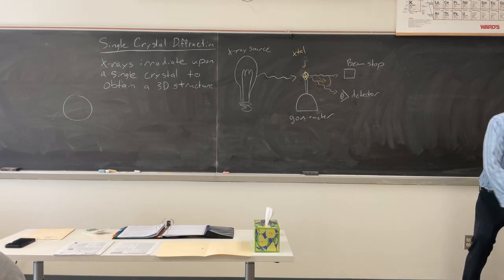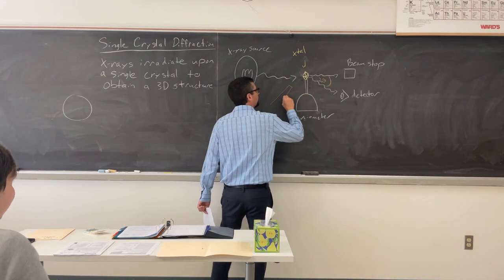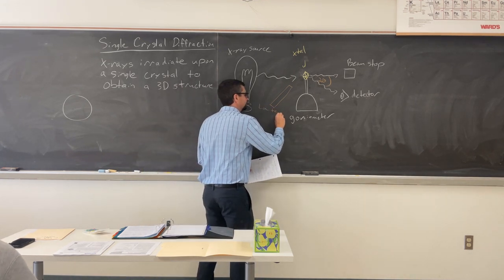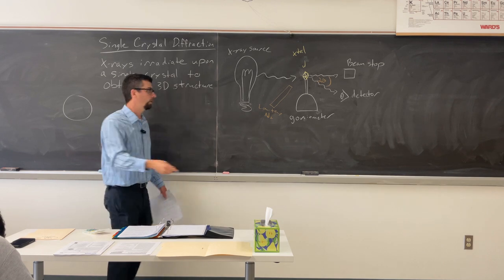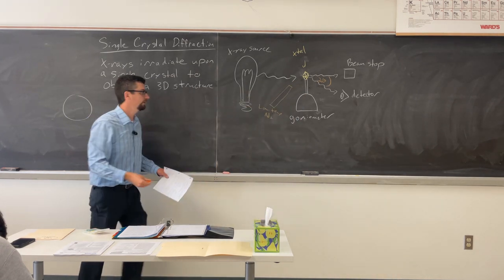That's exactly what happens. We have low temp N2. So it's usually liquid nitrogen that is boiled off, it's cold. And we try to hit this thing with cool nitrogen.